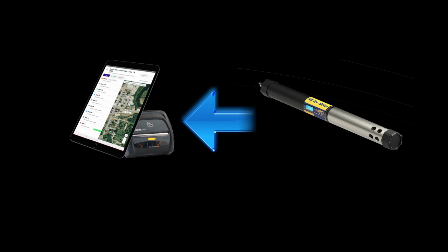Start by connecting your meter to your mobile device through its Bluetooth functionality. This is typically done by inverting your meter 180 degrees. This will activate the meter's Bluetooth to show up in your list of Bluetooth-enabled devices. Once the Bluetooth connection has been established, open the Field Data Collection app and enter a sampling event.